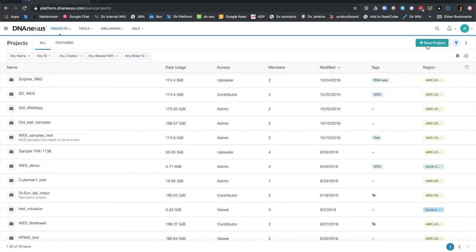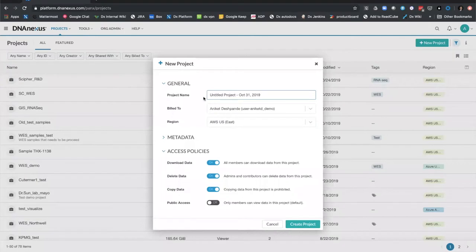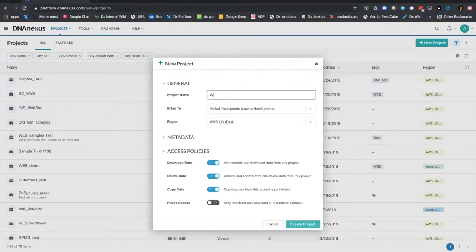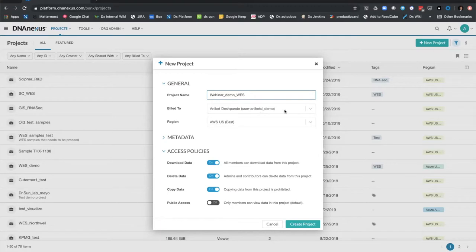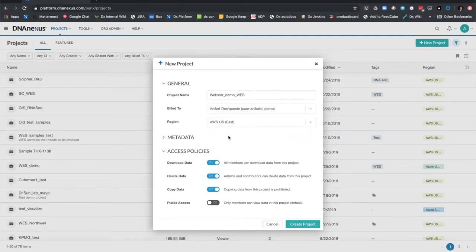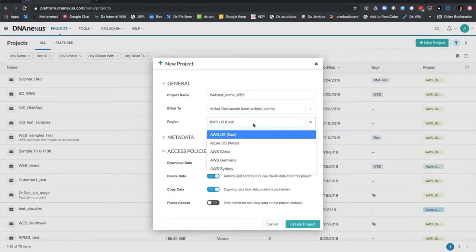I can create a new project by hitting the new project tab on the top right-hand corner, which pulls up the new project window. I can give my project any name, so if I have some whole exome samples, I can call it 'demo whole exome samples.' I can also specify the billing account responsible for paying for compute and storage for this specific project, and choose the underlying cloud region since DNA Nexus is multi-region, multi-cloud.